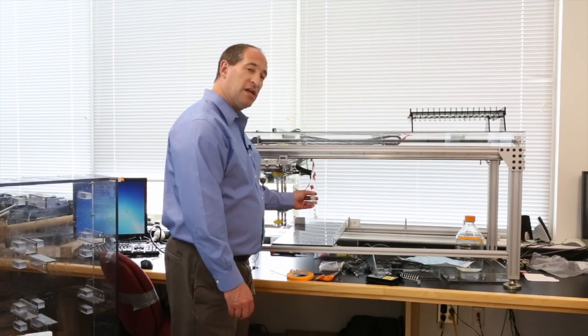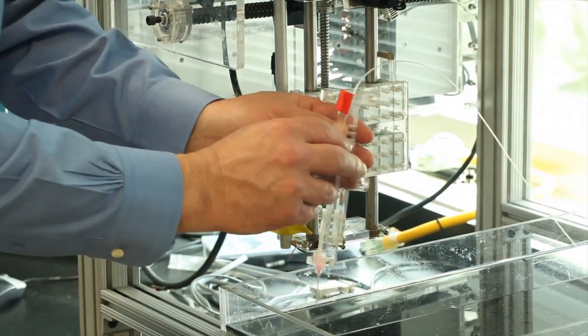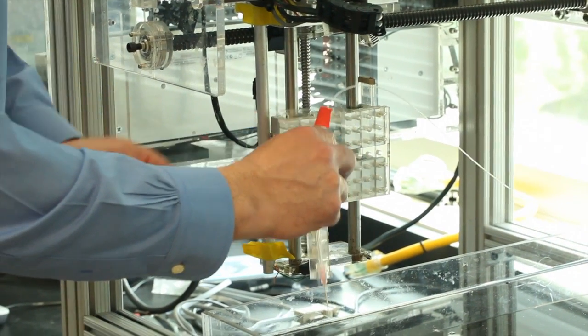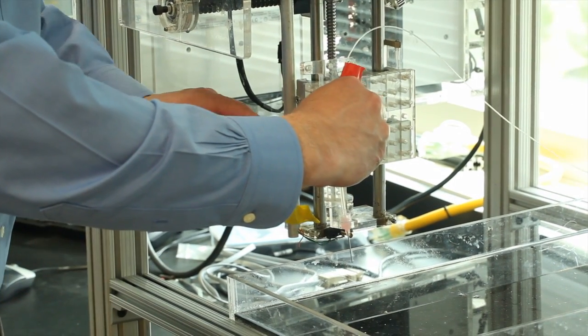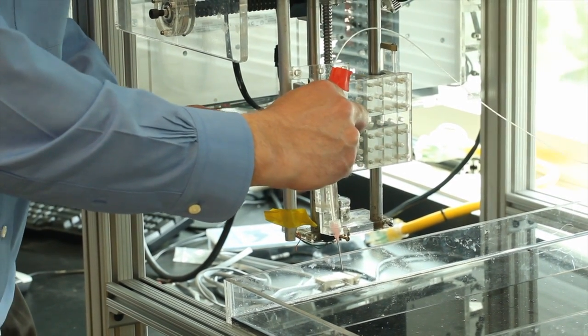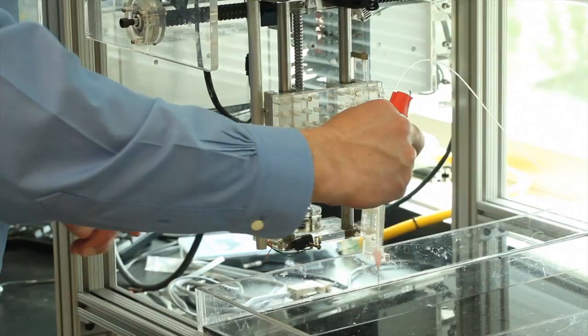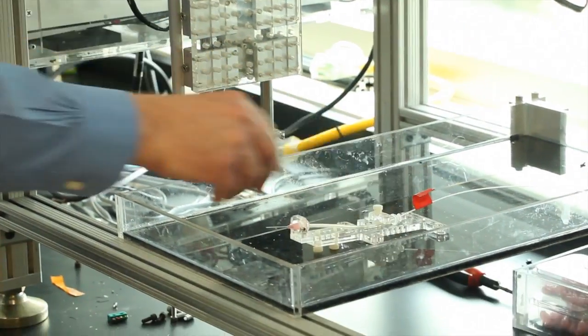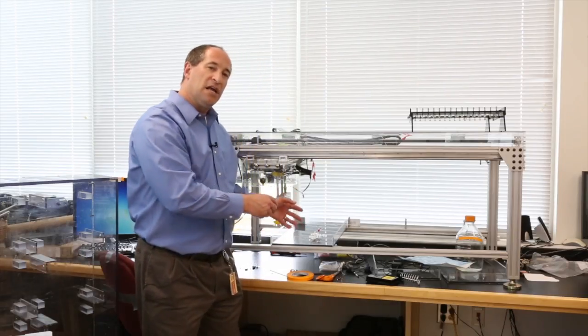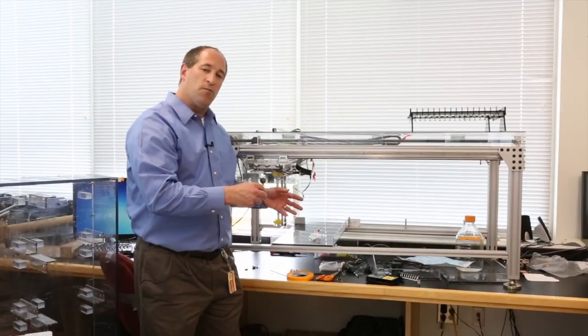To make our fibrin sutures we co-extrude fibrinogen and thrombin through this syringe, which attaches to this piece here. This is essentially a three-axis machine which allows it to go back and forth and makes lines of fibrin, essentially a thread.